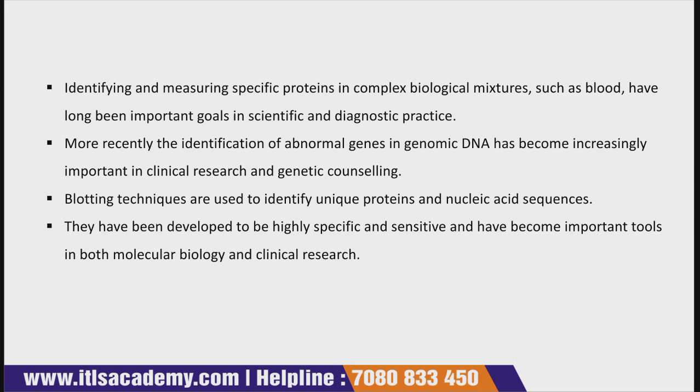More recently, the identification of abnormal genes in genomic DNA has become increasingly important in clinical research and genetic counseling. We are all aware of this term, abnormal gene. So the blotting technique is used whenever you want to identify abnormal genes in any genomic DNA.